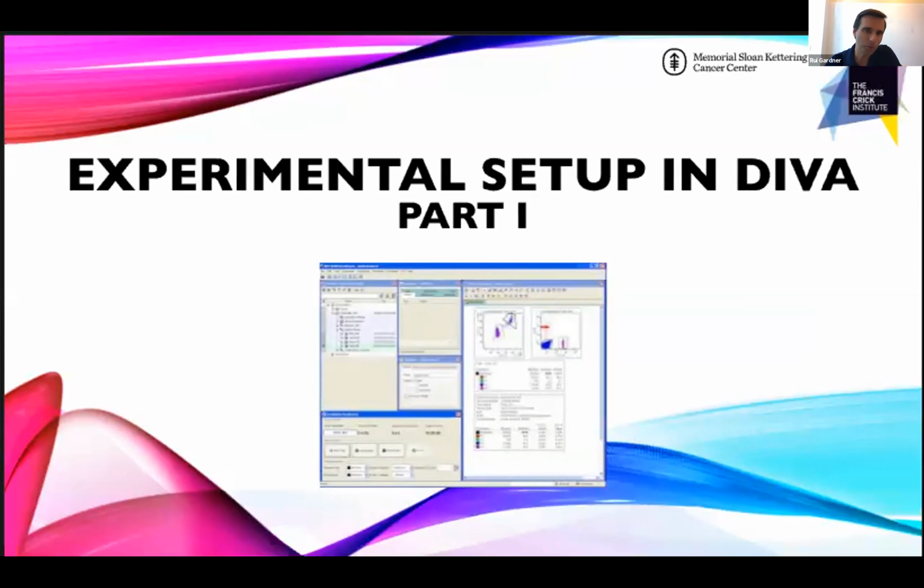I want to say just a few things about Open Flow Cytometry. This is our first Open Flow Cytometry virtual class, and before introducing our speakers and instructors today, I just want to say that Open Cytometry is intended to be open source, interactive learning that is targeted at scientists to provide them with expert knowledge in flow cytometry. So from basic to advanced flow cytometry.